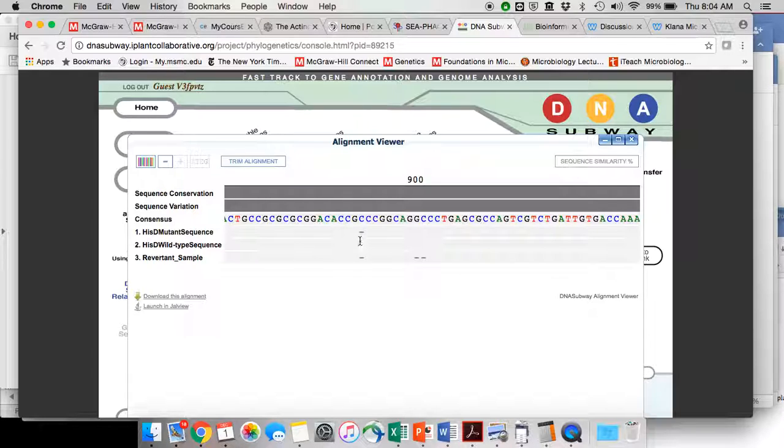So here in your revertant, there were 2 additional single nucleotide deletions. When you put these nucleotide sequences into ExPASy and translate them, and then you align them in the muscle program like we did in lab, then you can see what is the actual change in the amino acid sequences. And that's the extent that we need to look at for what was happening here.